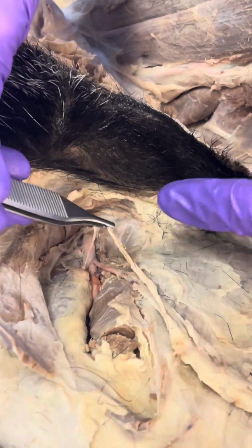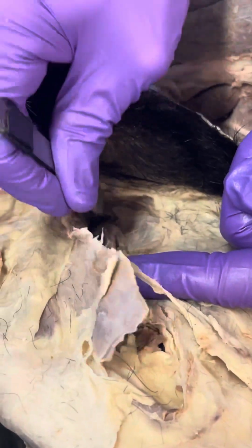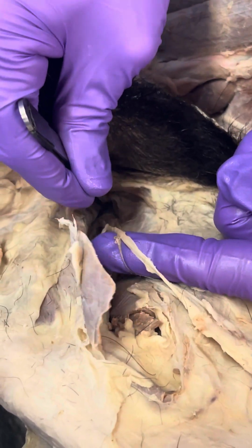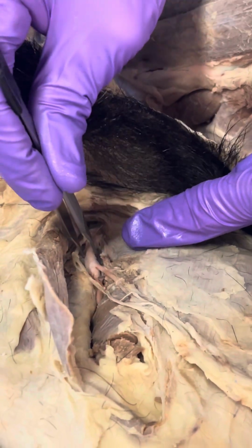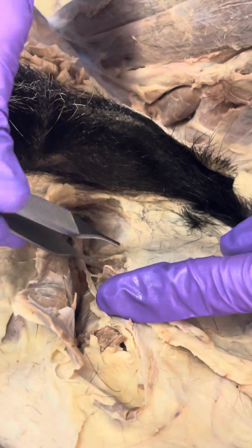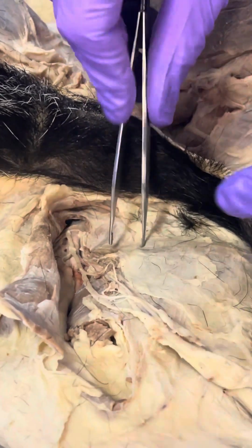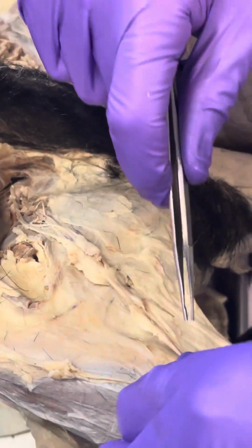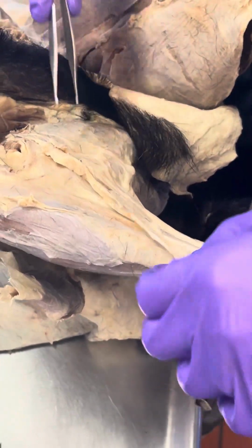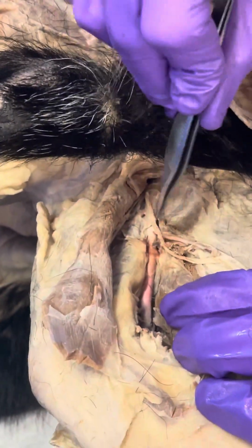So we have the saphenous nerve here, and if we follow it deep enough, proximal up the limb, we'd actually find our femoral nerve, right? Okay, so then this is the femoral artery and vein, and then this is the branch off, saphenous here. The saphenous artery and vein branches off femoral. So then here's our medial saphenous artery and vein, and this also has a cranial and caudal branch. And if we continued and followed the femoral artery, the same trunk.